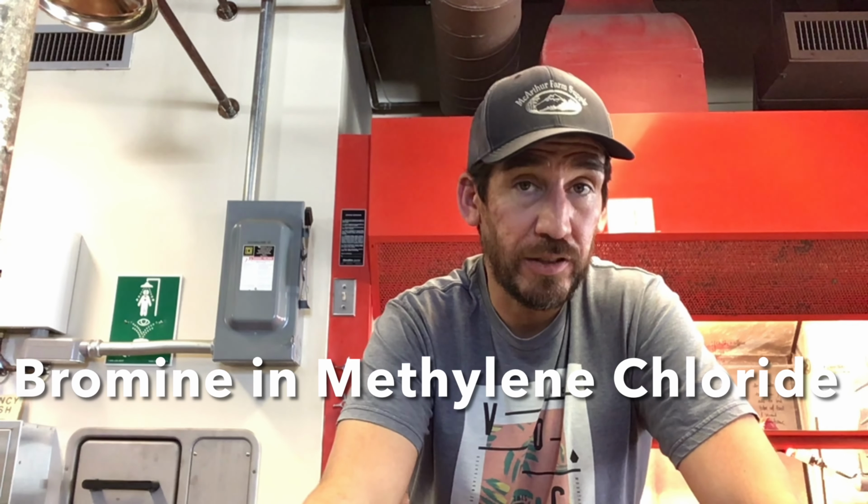So, test for unsaturation using bromine and methylene chloride. What we're doing here is we are going to test a couple samples, some saturated, some unsaturated, just to see what a positive test looks like and what a negative test looks like. For bromine and methylene chloride, it's a 2% solution of bromine in methylene chloride. So it is diluted, but bromine is one of 2 elements on the periodic table that is actually a liquid at room temperature. So pretty neat, right?